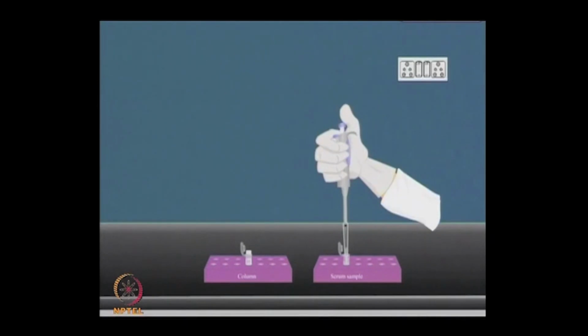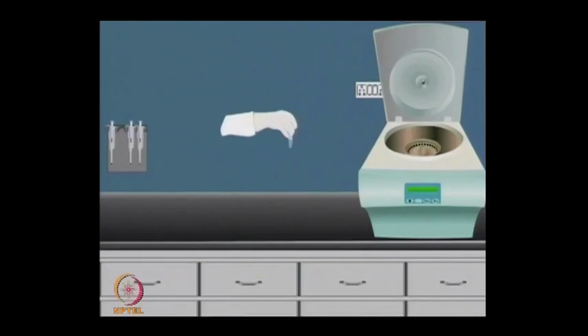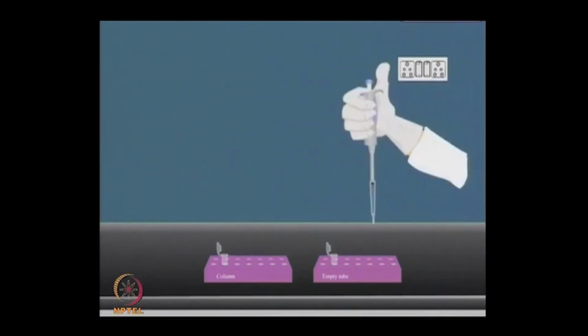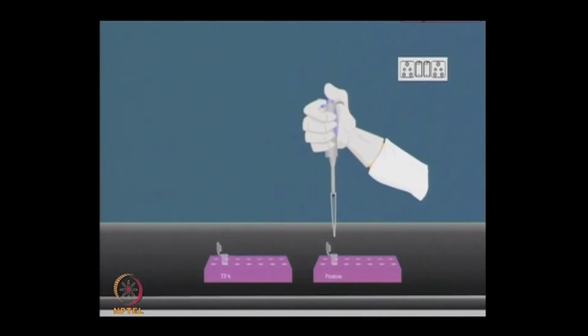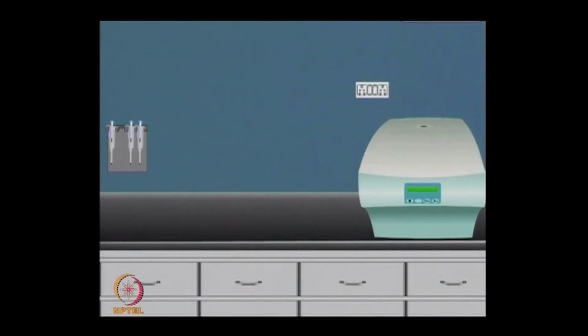After sonication is done, then we can add the serum sample on the columns. Usually these are commercially available, which can deplete various high abundant proteins. Now, these depletion columns bind only the high abundance proteins onto their matrix through affinity interactions. Once the serum has been processed using a depletion column, precipitate out the remaining proteins by using trichloroacetic acid and acetone.